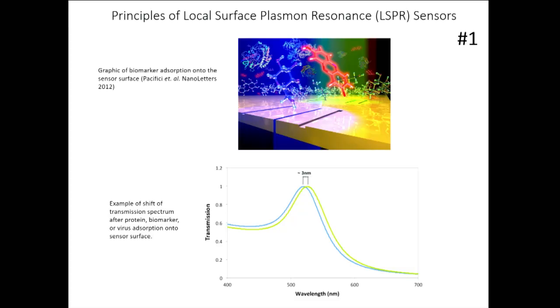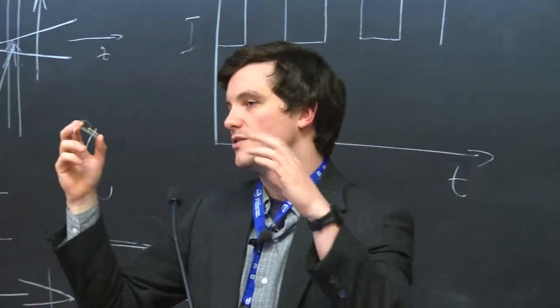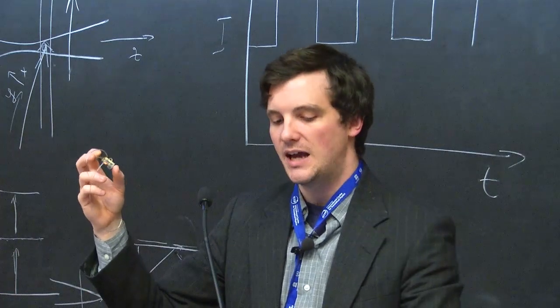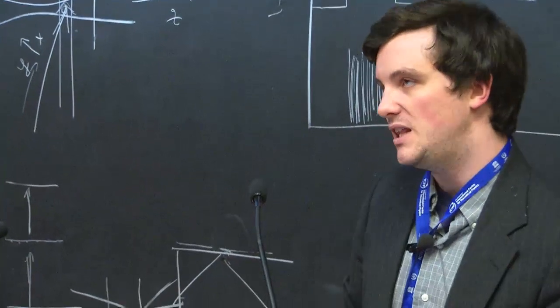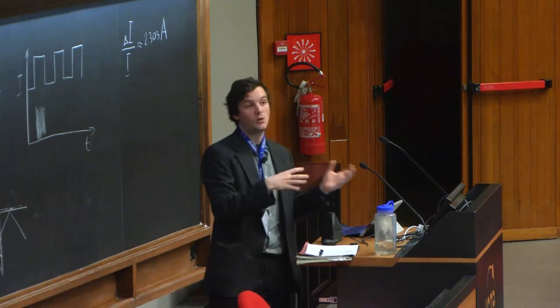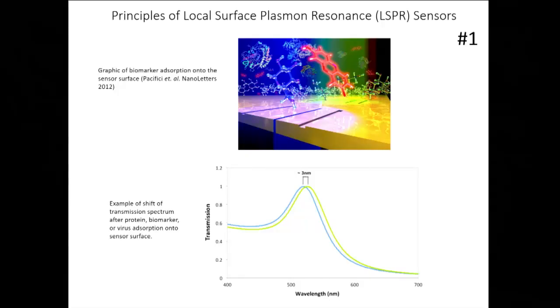So the way localized surface plasmon resonance works is, on this sensor there is a nanostructured grating. There's a nanohole array on this sensor. And these nanostructures support plasmon resonances, which are collective electron oscillations. When a molecule of some substantial weight, something larger than an ion, but around the size of a protein molecule, kilodalton size, is adsorbed onto the surface, specifically through biochemistry, it can react with the near field of the sensor and change the location of the plasmon resonance, so where spectrally the electron oscillation is occurring.